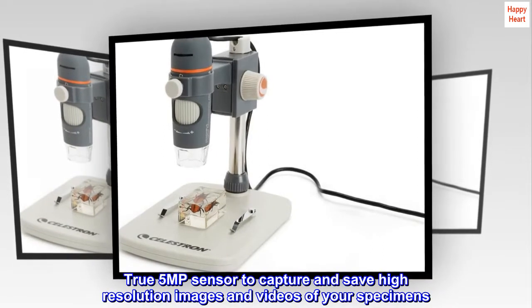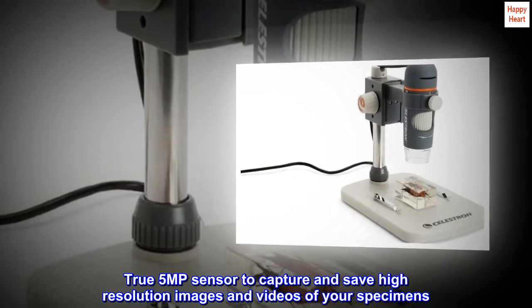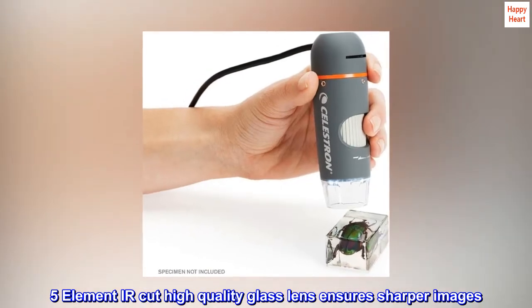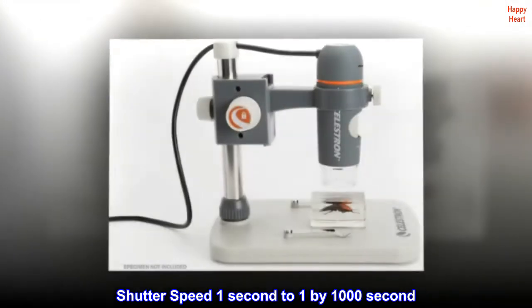True 5MP sensor to capture and save high-resolution images and videos of your specimens. 5-element IR cut high-quality glass lens ensures sharper images. Shutter speed: 1 second to 1/1000 second.